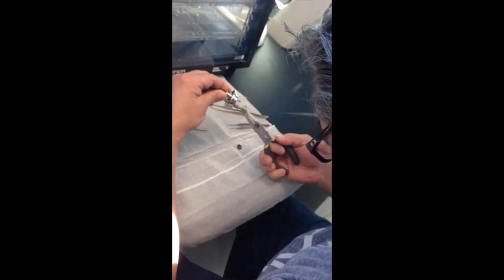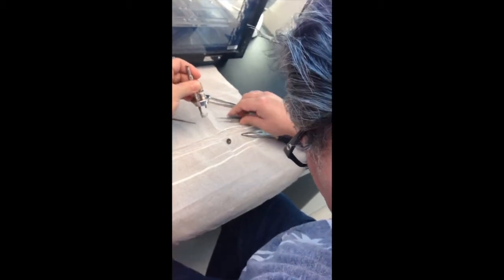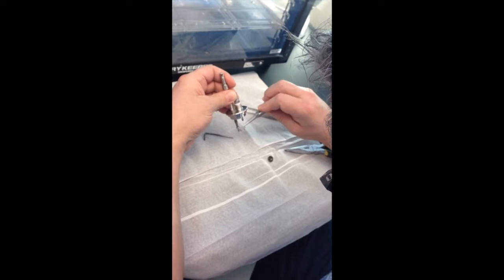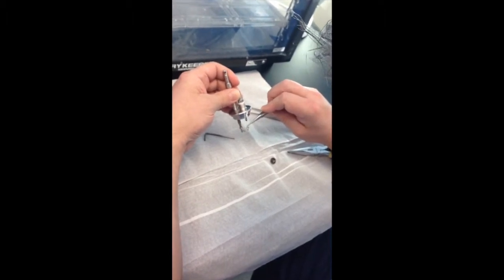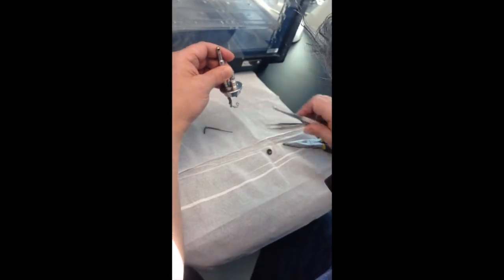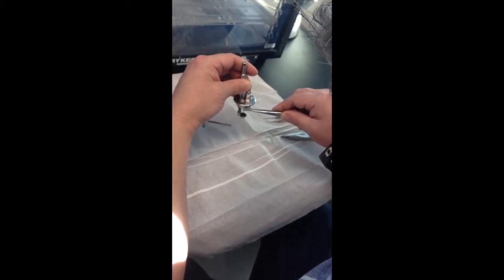Position the pellet saucer cradle underneath the terminal prongs. It only rotates freely in one direction. Work the wire cradle up or down, adjusting the height to the appropriate location. Position the saucer on the support cradle wire.